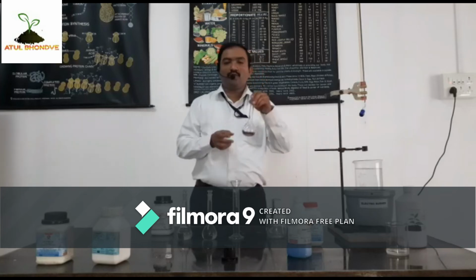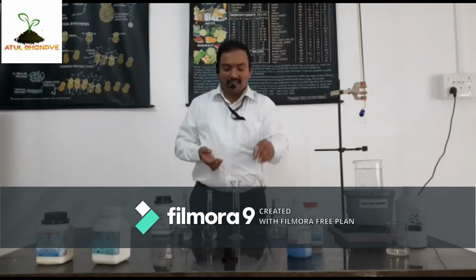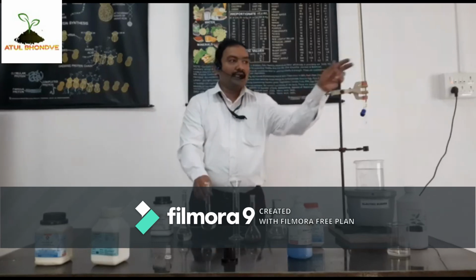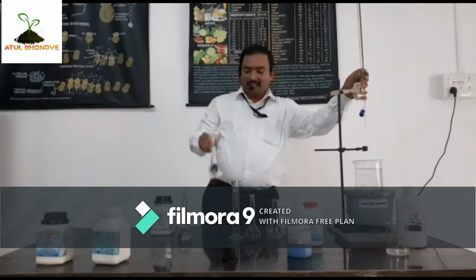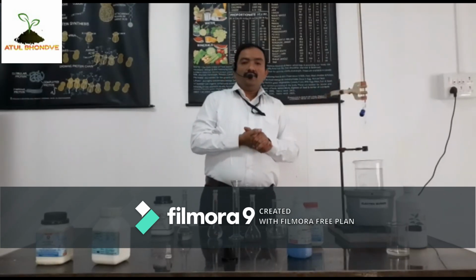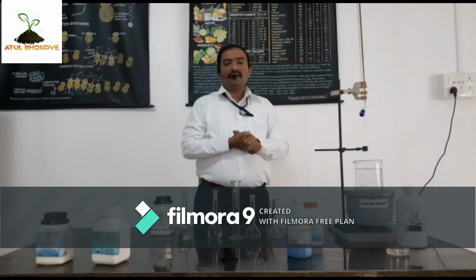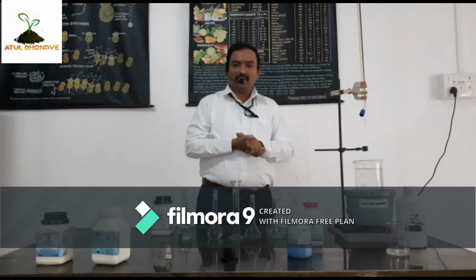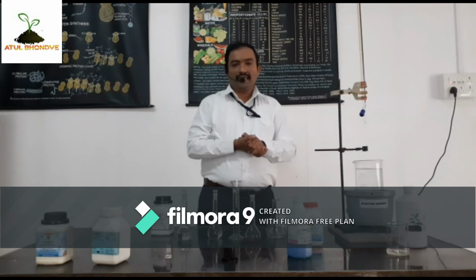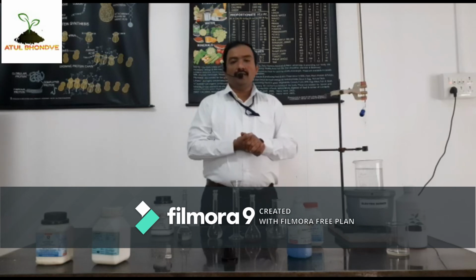Take 25 ml of Benedict's reagent into the volumetric flask, then fill the burette with the fructose or lactose solution, which is called the test solution, and perform the practical like the glucose solution. Observe the color. Perform the practical repeatedly so that a constant reading will be obtained.